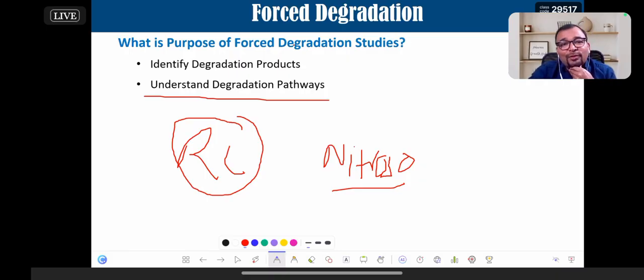What is the use of understanding this degradation path? We are packaging control, a very good response, Manoj Kumar. Arpita says you can define the storage condition, also very good response. And you can eliminate those conditions, right? You can eliminate those conditions so that you will not have those potential degradants.